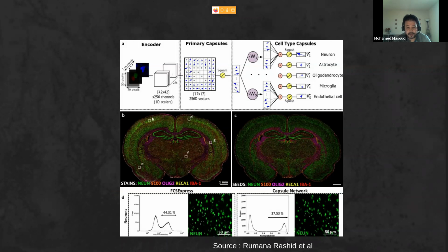So we can see here they have two approaches here to use. One of them is threshold based. So they go to the intensity of the cells and use this intensity as an indication for the cell type. So for example, if a certain cell has a high intensity in a certain marker, then they can use that as an indication of the cell type. But this approach, according to their study, wasn't the best approach to have.